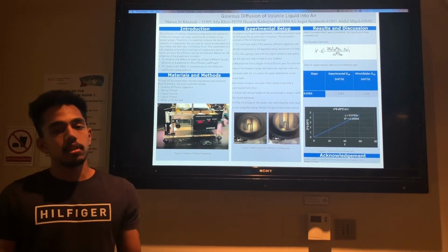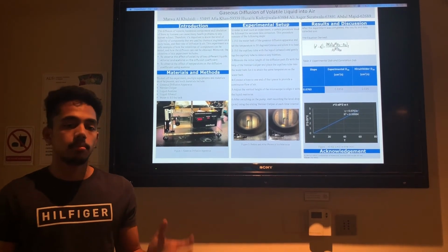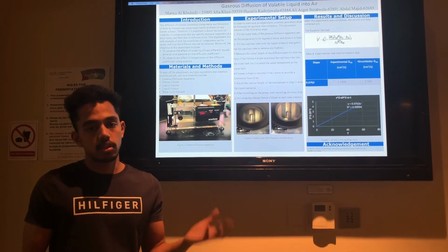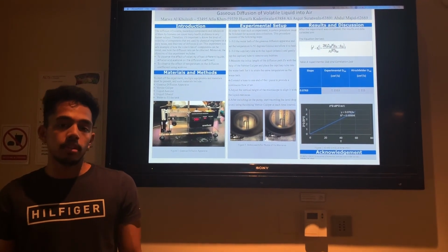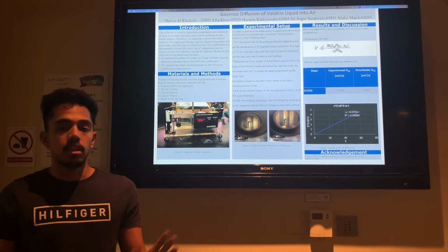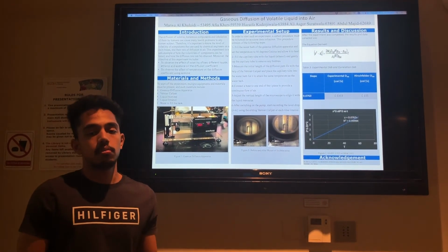We started off the experiment using ethanol as our solute, and we measured the change in level of the ethanol every 15 minutes until we got 5 readings. We used 2 different temperatures to get these readings. Since ethanol has a high boiling point, the change in level of ethanol is really low. Therefore, we had to use acetone as our solute for the next trial. Acetone gave us a good change in level for the same time interval.